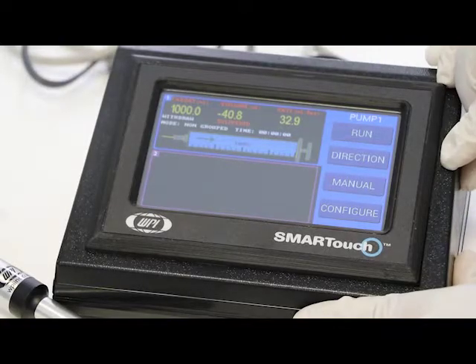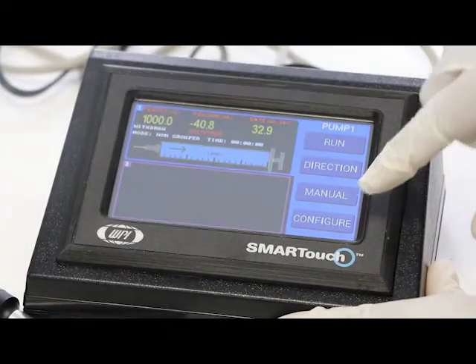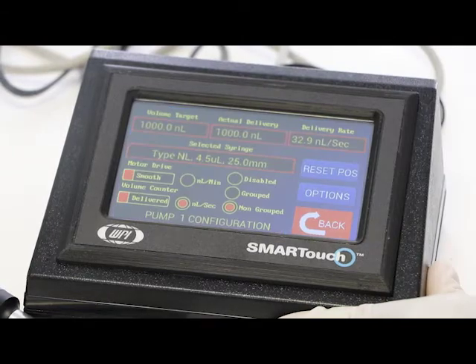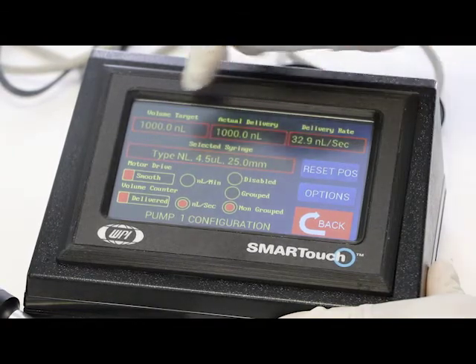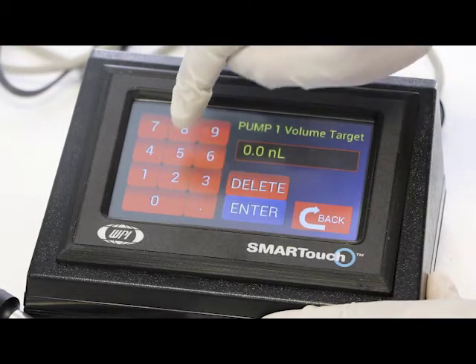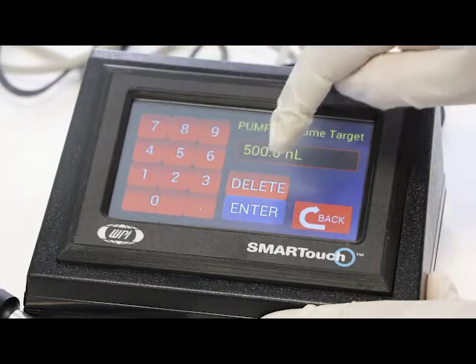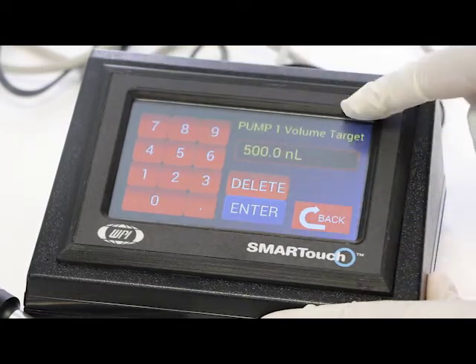So now we're going to show how to configure the rates and the volume target that you want to inject. You're going to hit configure. First thing that we should do is do the volume target. You hit the actual square for the volume target. And you put it in. It's by nano-liter, so you will put how many nano-liter you want to inject. We're showing you that we want to inject 500 nano-liter. And then you hit enter.